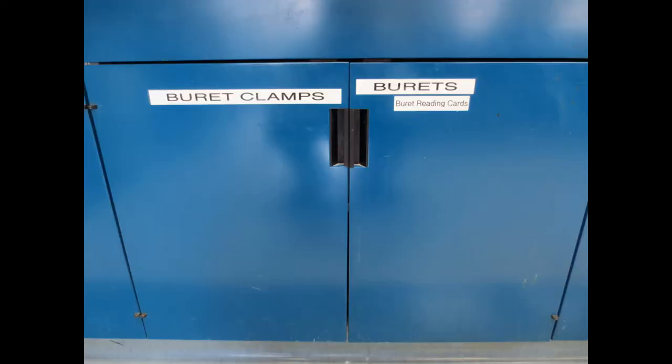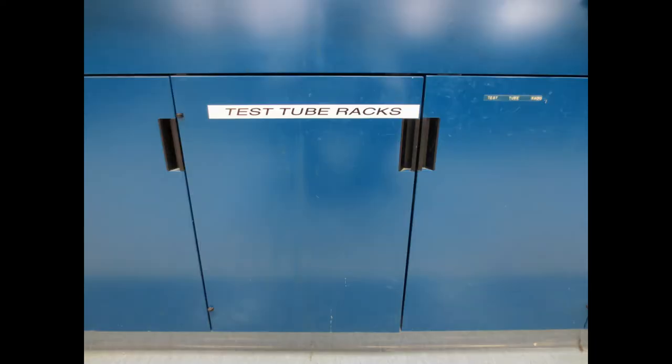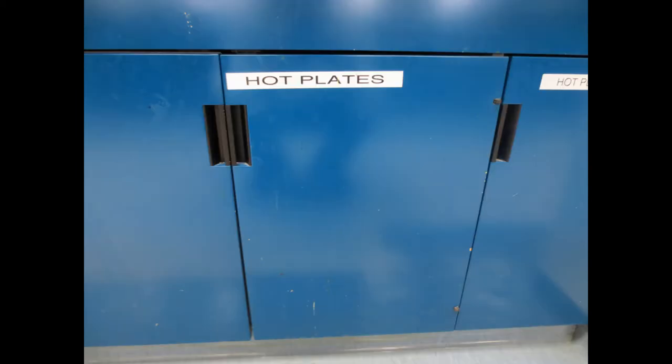Burette clamps, burettes, and reading cards. Test tube racks of various sizes. Hot plates, of which there are several different models.